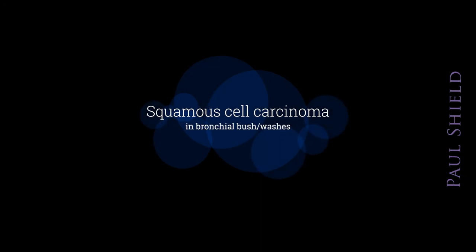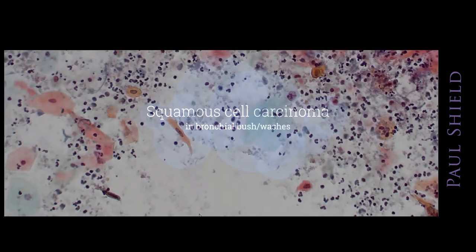In brushes and washes, similar appearance often. So this is one here. You can see the quite elongate looking cell there. There's a lot of neutrophils and debris in this case as well.